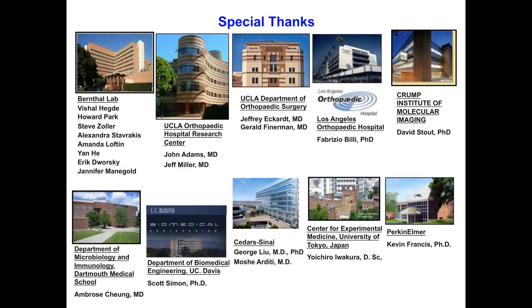We have one question left. Using the Lumina 3, can you image both the tumor as well as the trafficking of the immune cells, CD8, simultaneously using two bioluminescent signals? The quick answer to that is absolutely yes.